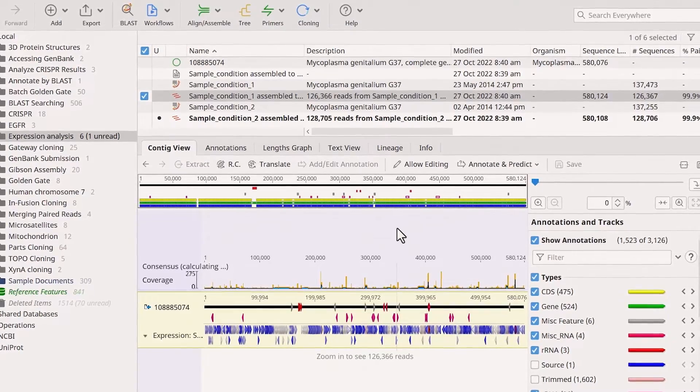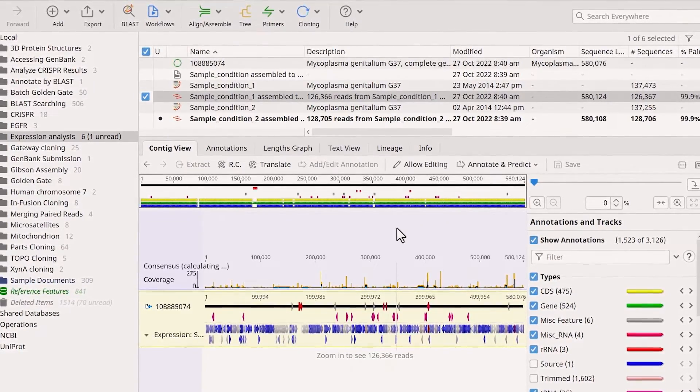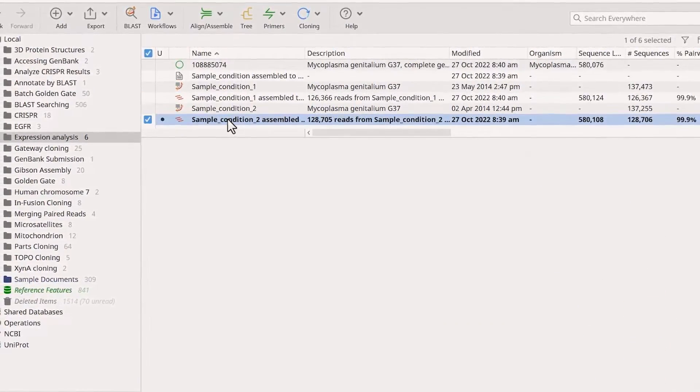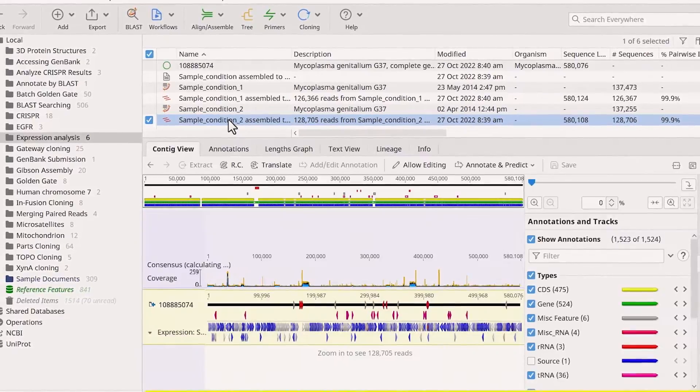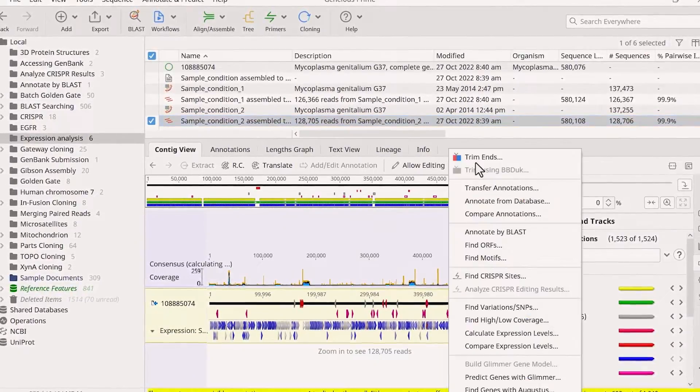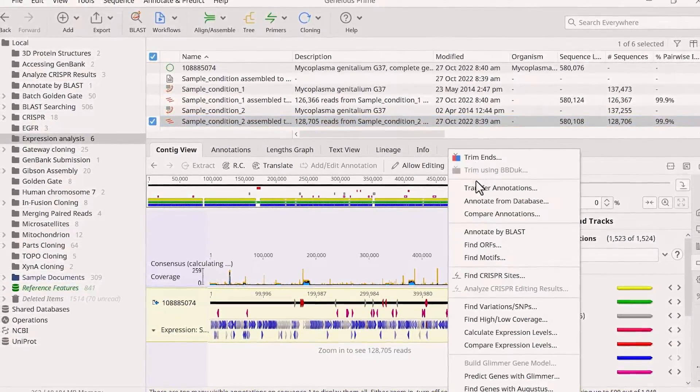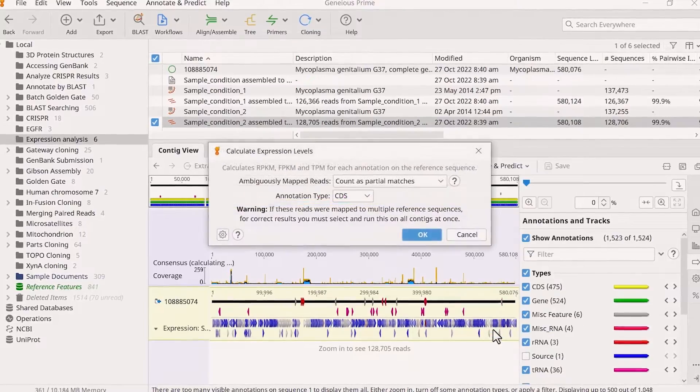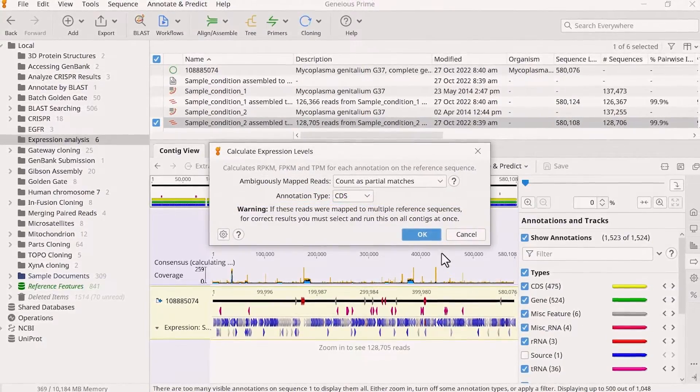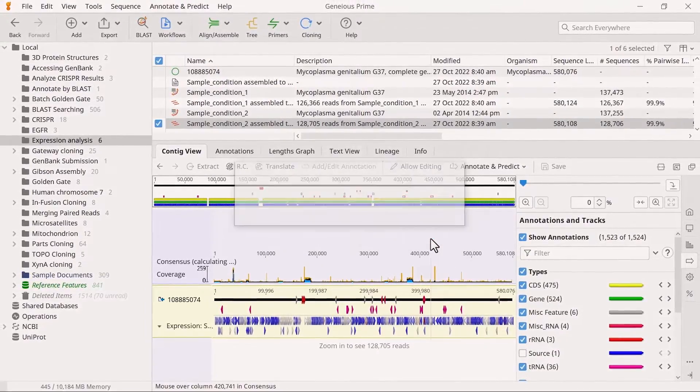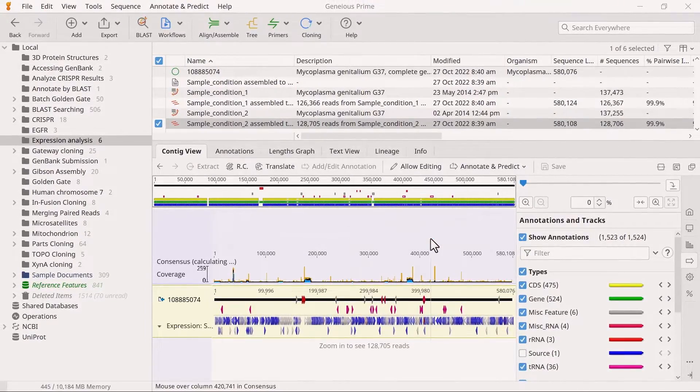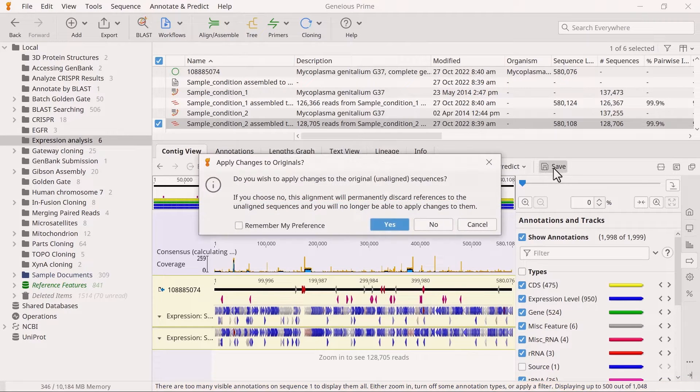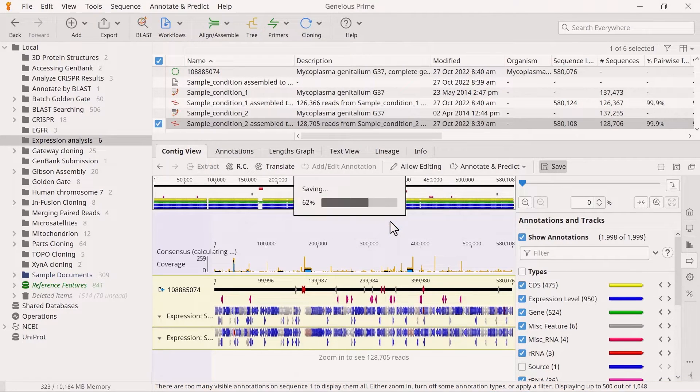Because my two assemblies represent different experimental sample conditions, I need to run the Calculate Expression Levels analysis separately for the other sample. If you select both assemblies and run the analysis on both at once, Genius will assume that these are a single sample, and your calculations will be incorrect.